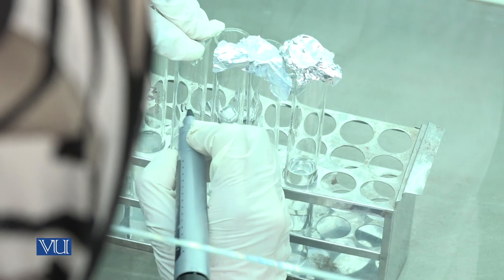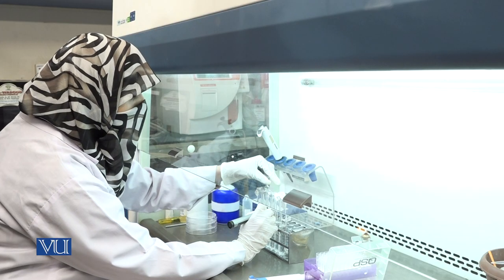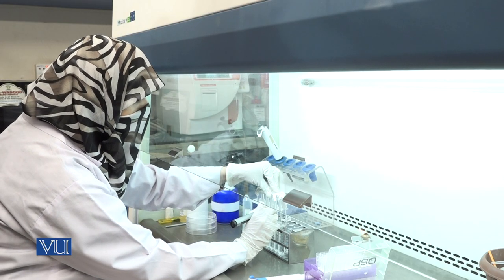The second test tube is 10 to the minus 2, the third is 10 to the minus 3, and so on up to the sixth test tube.